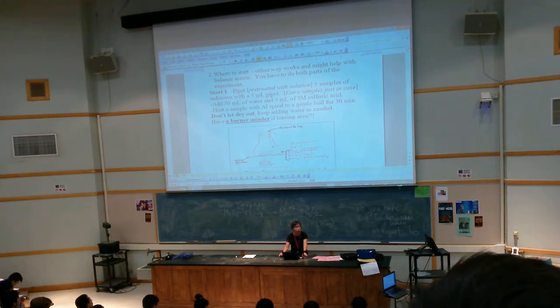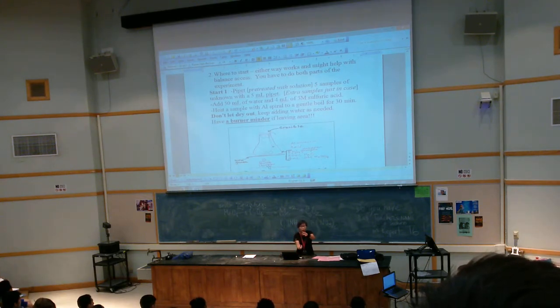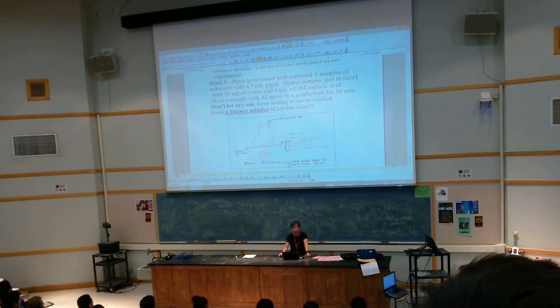Okay? I'll have this drawing again on the board for you if you forgot, okay? So your solution will contain your 5 ml of unknown sample, 50 ml water, and 4 ml of 3 molar sulfuric acid. And then you're just going to cook it. Put the ring stand, put the wire gauze underneath, and do a gentle boil for 30 minutes, okay? When you're boiling, if some of the water goes away, you can shoot some DI water from your wash bottle, because if you let that go to dryness, the whole lab will be coughing up a storm. It's okay to shoot more because you're titrating against the number of moles of Fe in there.